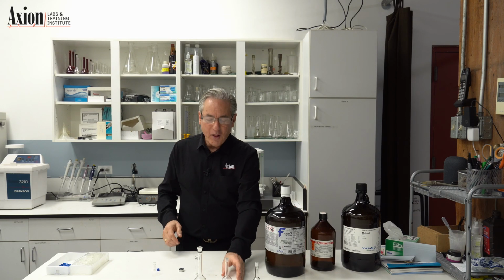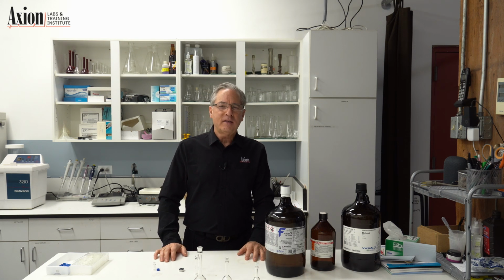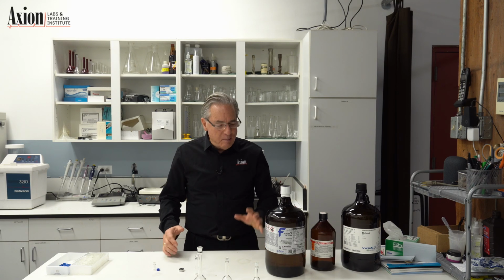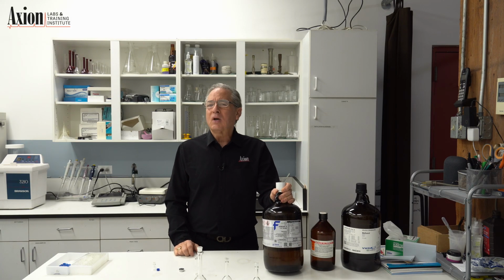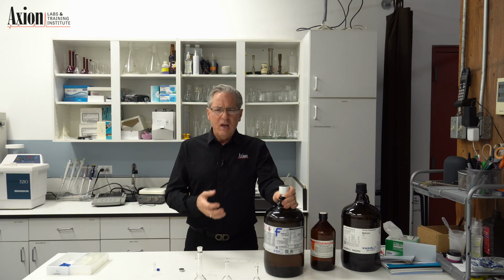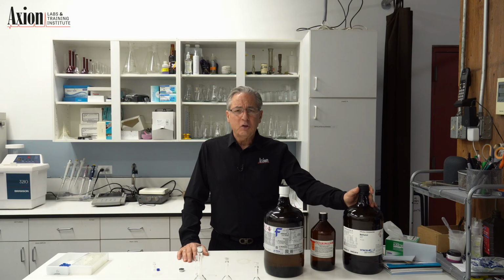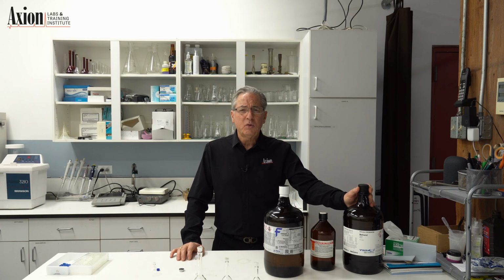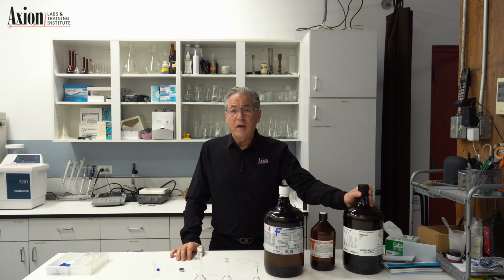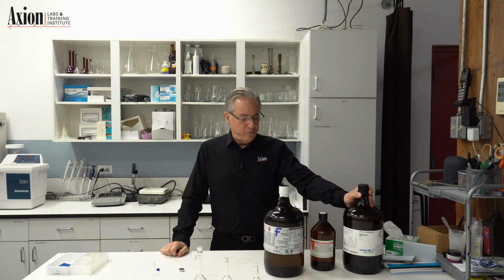What do you dilute with? Well, whatever the sample is soluble in. The most typical thing is going to be hexane, just because everything we do in GC is volatile. Volatile compounds all tend to be pretty nonpolar, so it's a good match. So that's why hexane is probably the most common solvent in GC. But again, the goal here is you must dissolve your sample. So if your sample's more on the polar side of things, methanol is a favorite. So when I'm looking at drugs of abuse, we typically will use methanol as a solvent because it'll dissolve anything that's meant for the human body.